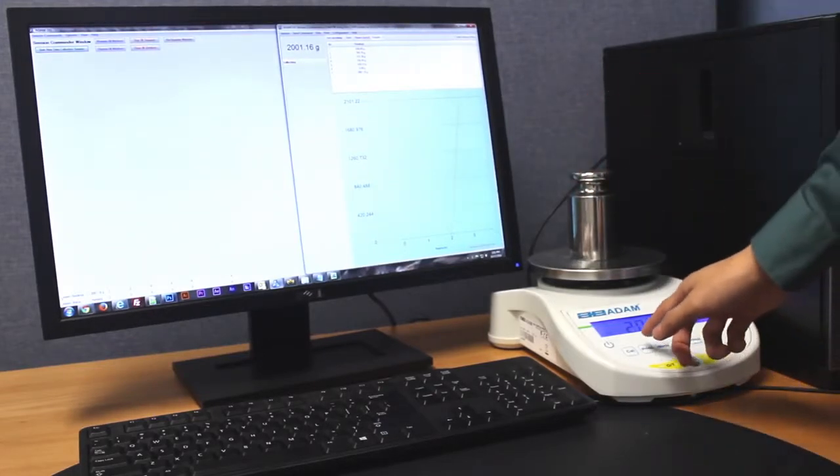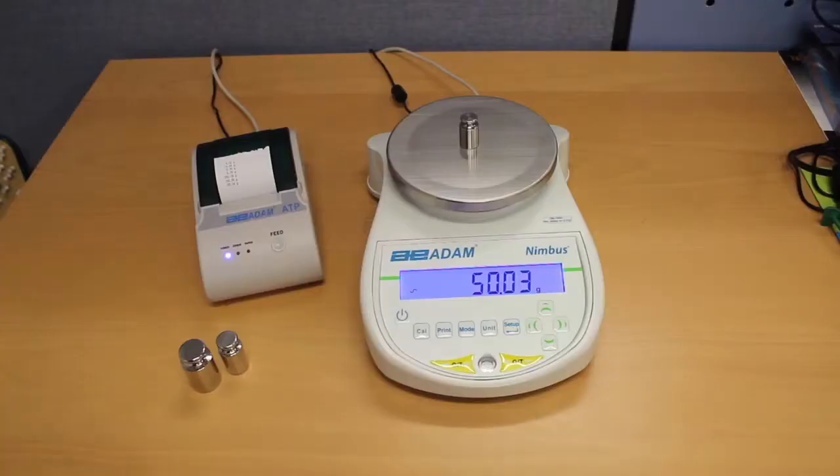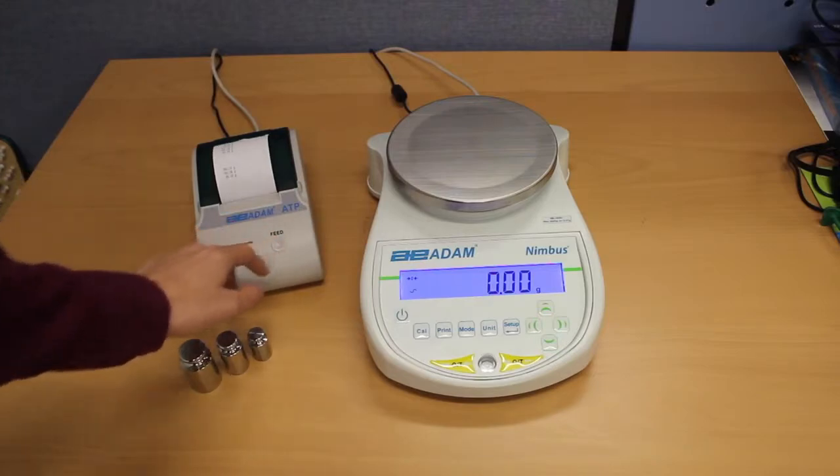To streamline data collection and analysis, Adam DU can be installed on your computer to receive readouts from Nimbus. All data conforms to good laboratory practices.